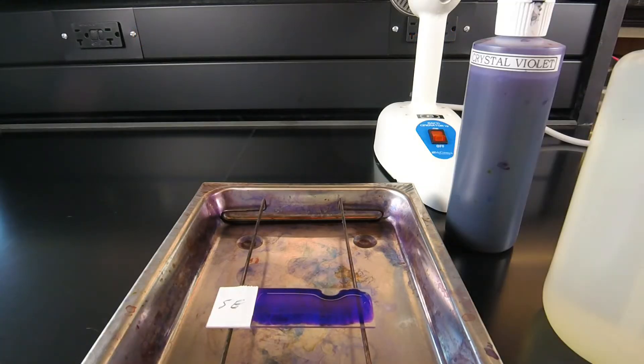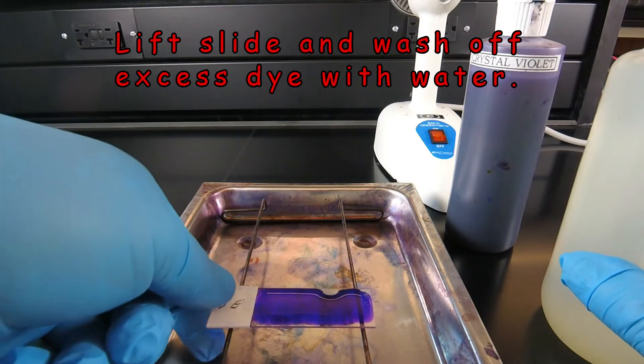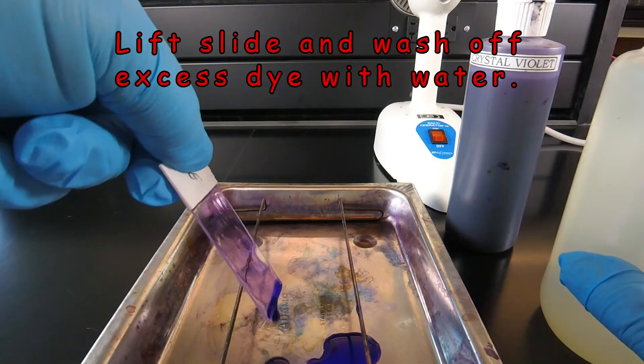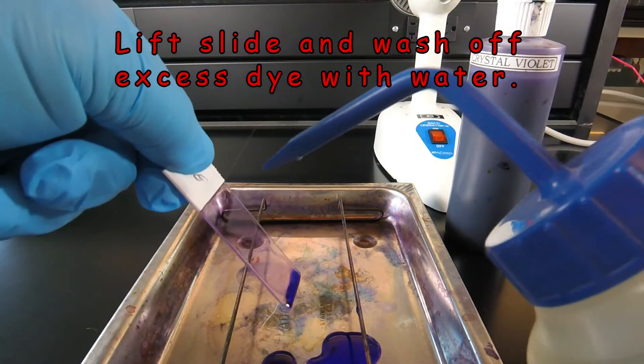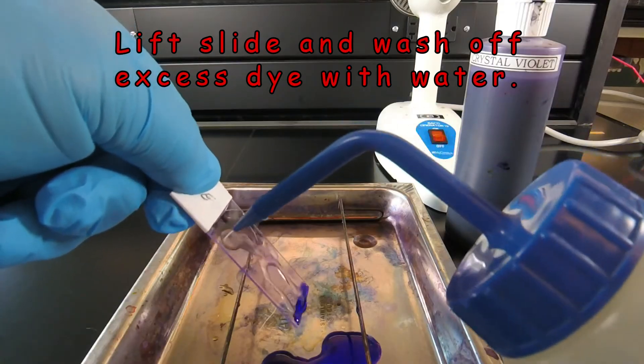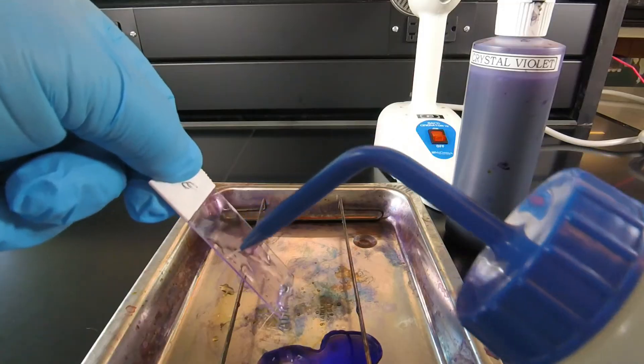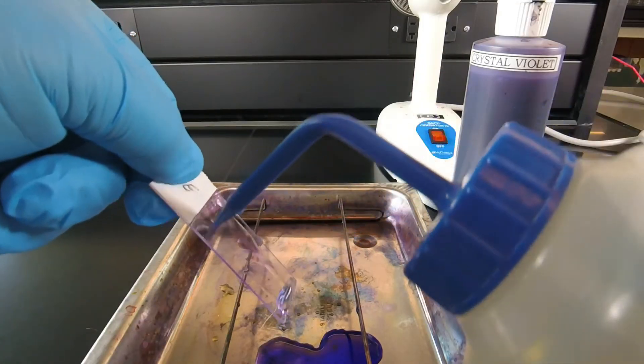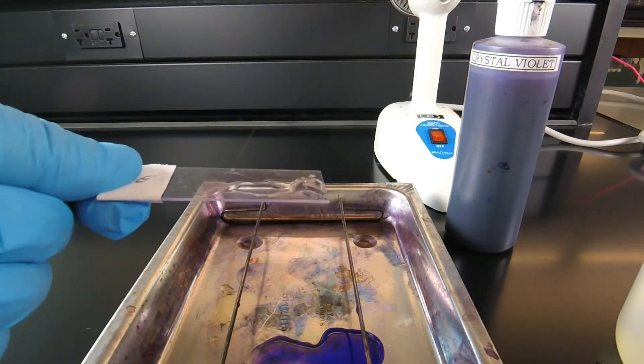Crystal violet has now been on the slide for one minute, so we're going to wash off the excess dye using deionized water. To do that, we pick the slide up by the label and hold it over the staining tray. We direct the water at the top of the smear and let it run down over the slide, watching the bottom. When it looks relatively clear coming off, we've washed off the excess dye.